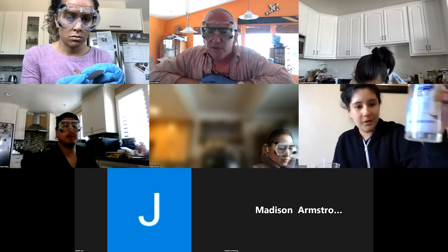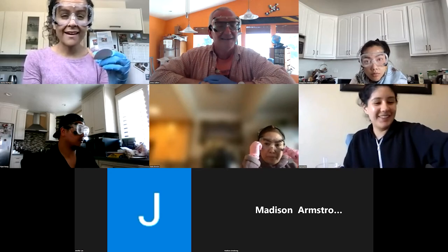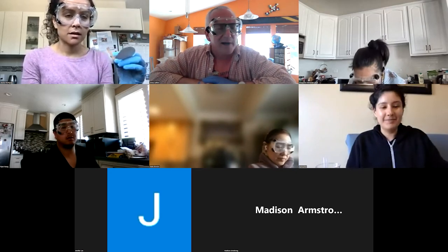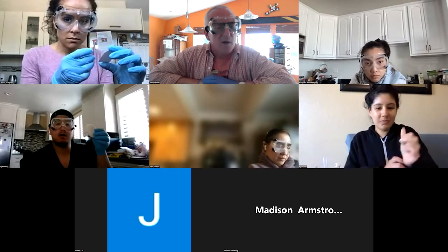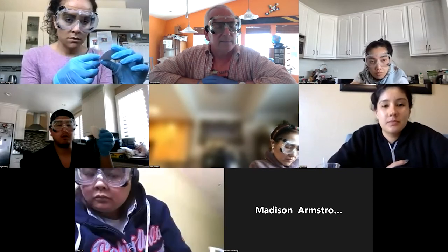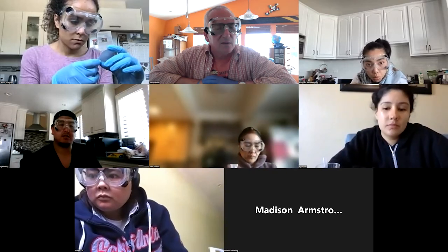Is that shampoo? No, it's hand soap. Oh, okay. What about you, Ryan? What kind of soap did you try? I used the Dove soap bar. Oh, bar. Oh, cool. So what pH did you get? I got a pH of 6 as well.